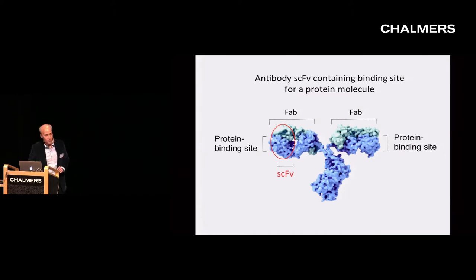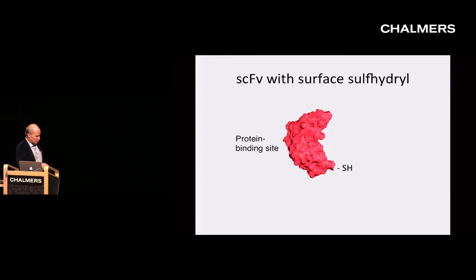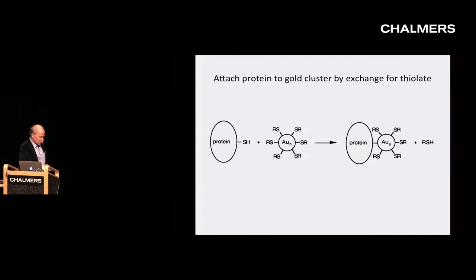In order to attach the scFv to a gold particle, we've introduced a sulfhydryl group at the point indicated here on the surface of what is a crystal structure of a single chain antibody fragment. And then we developed the chemistry for thiol exchange to bring about the addition of one and only one protein to every individual gold nanoparticle.